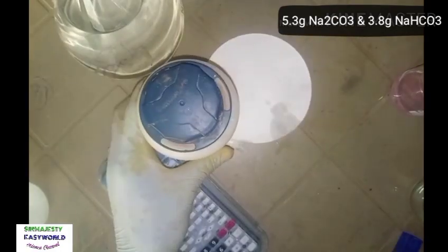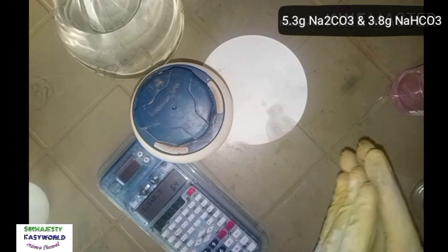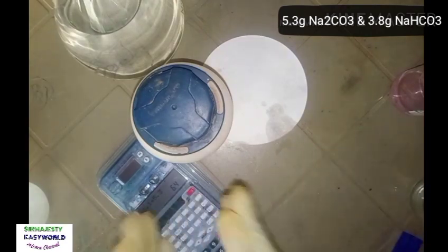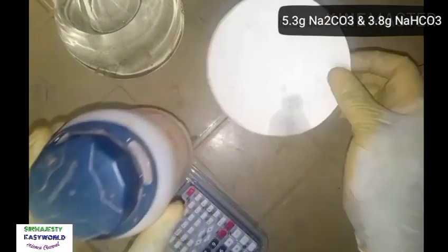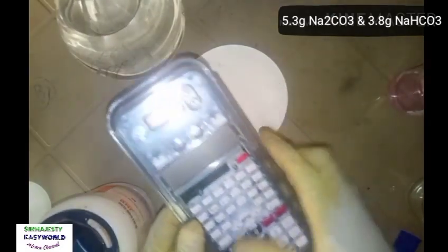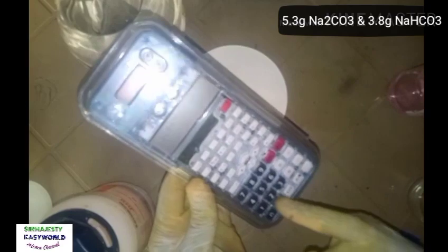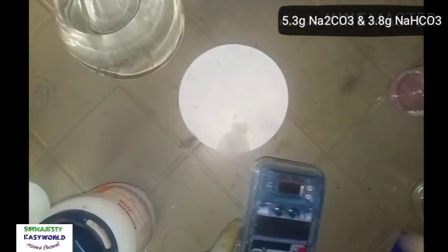Then when you have gotten the 6.4, you want to also measure the 3.8. You can do it separately or collectively at the same time, or to stay on the safer side, you keep away this one. This is the 5.3. You bring another filter paper and know the weight also. If the weight happens to be 1.1 again, you now just add 1.1 plus 3.8. You have 4.9. You still do like you did.